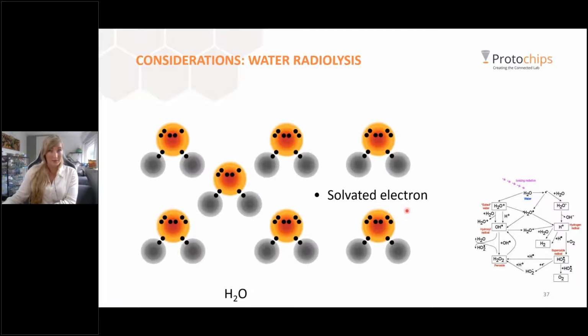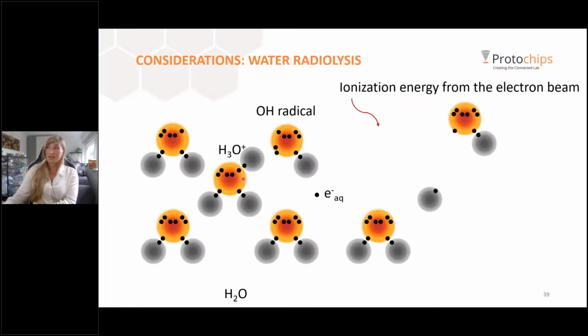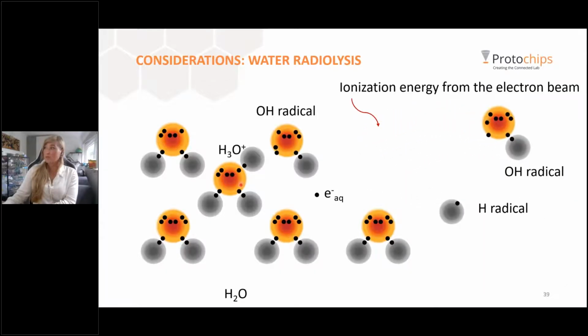These are highly active species. They immediately want to react with something else, reduce different parts of your sample, or start forming different components. And your water molecules can split into acids and OH radicals. Another thing that can happen is that ionization energy can split water molecules, forming hydroxyl radicals and hydrogen radicals as well.